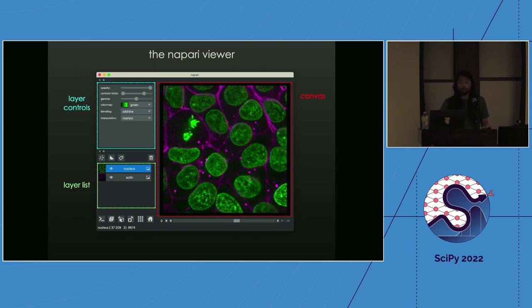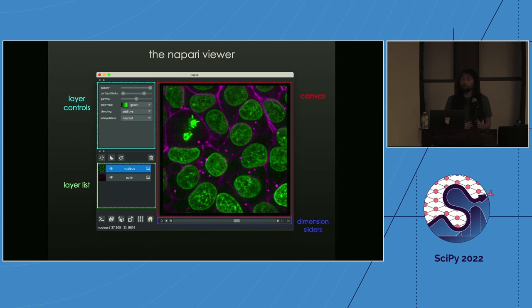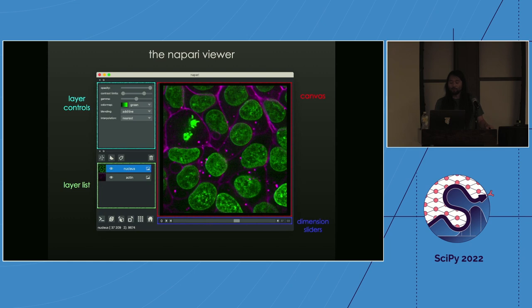We aim to be multidimensional. Your images might have three spatial dimensions, but also other aspects such as different wavelengths, different time points — potentially a fourth or fifth dimension. Since we can only display two or three dimensions in the viewer, for all remaining dimensions a slider is generated at the bottom, allowing you to choose which slice, time point, or channel you're currently viewing.